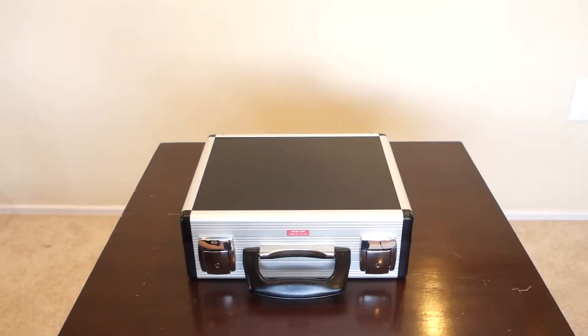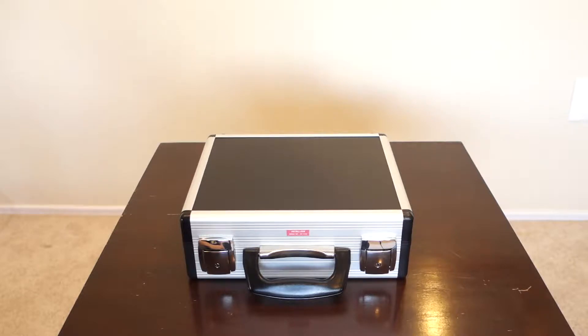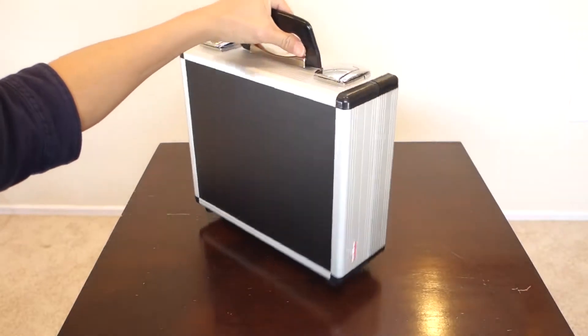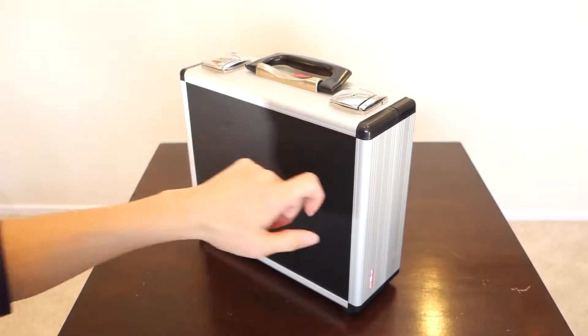Welcome to the unboxing of the Torimeter, otherwise known as the Fish Freshness Meter. As you get this out of the box, you can see right away that it comes in a case like this, which is very sturdy.